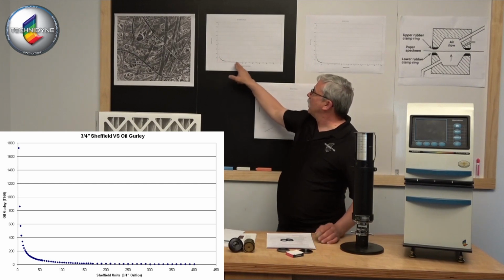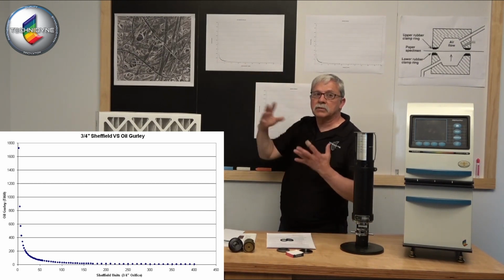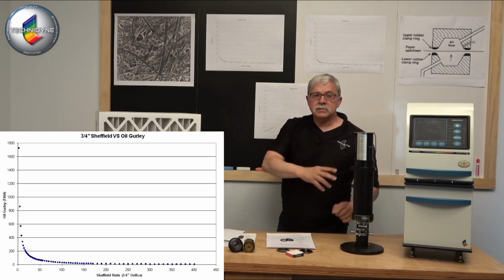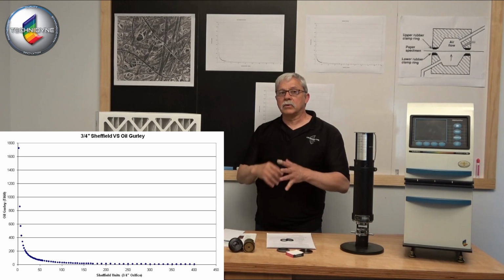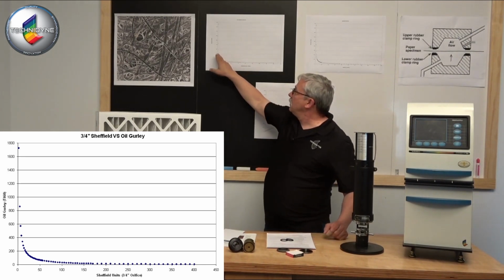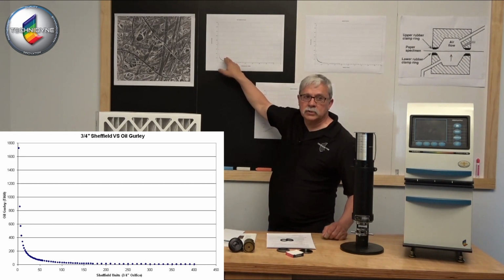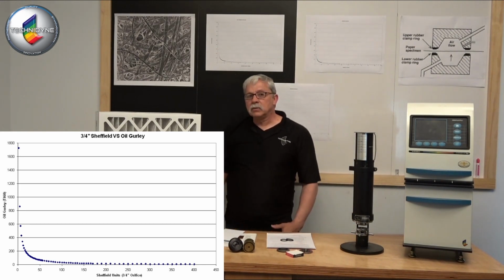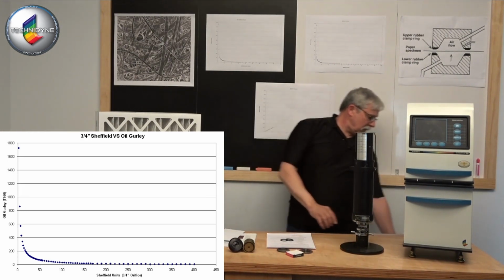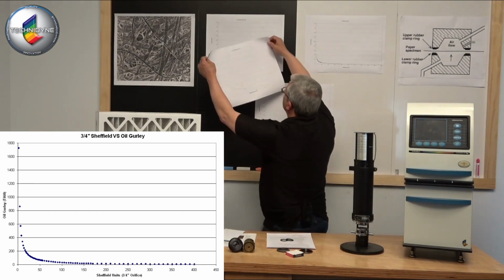In the same way, if I go higher and higher in my Sheffield scale, the airflow is going to be increasing. The number of seconds required to have this oil Gurley densometer go through its test cycle is going to get less and less and less. So in this area here, I've got a fairly decent resolution that we can utilize to compare one unit to another.